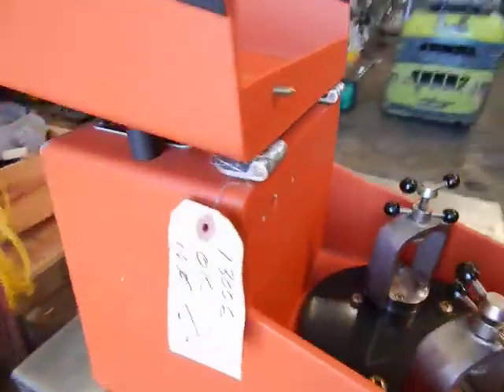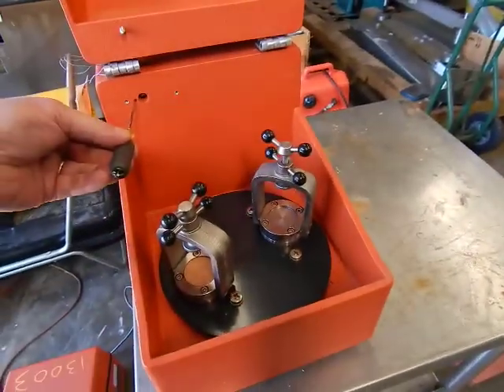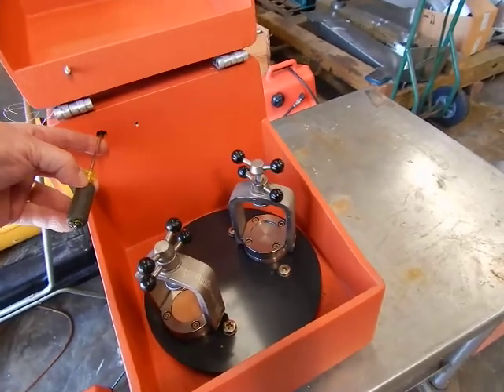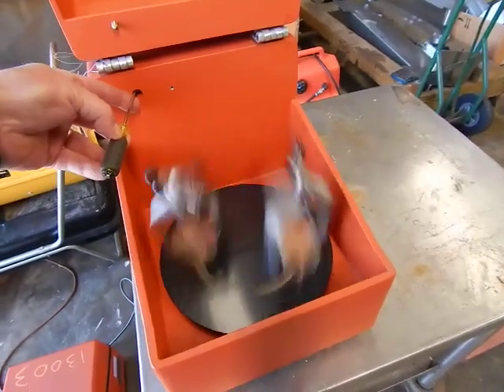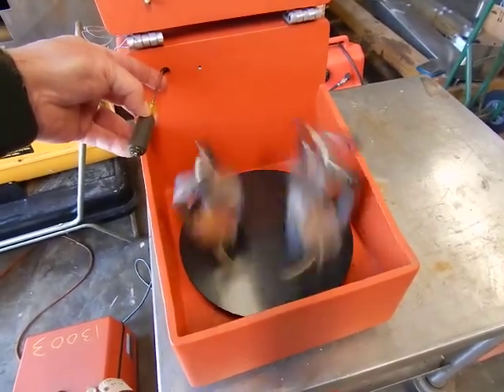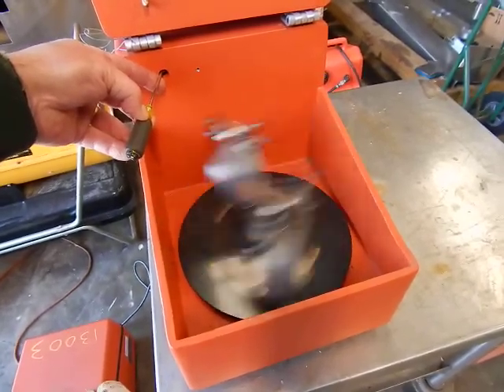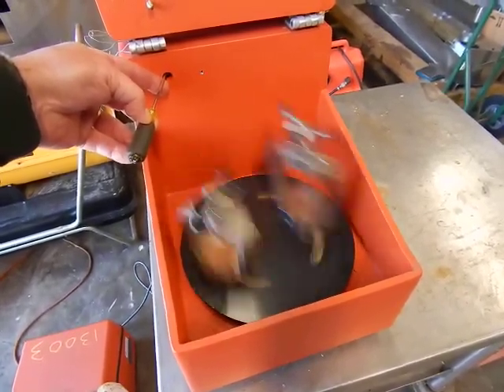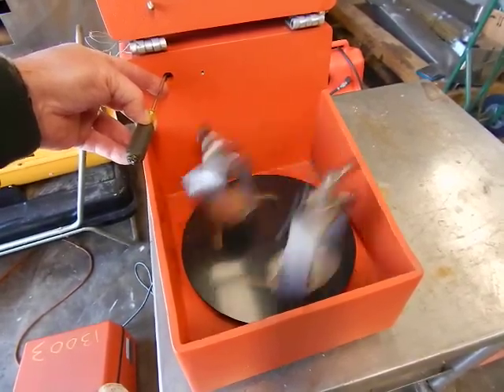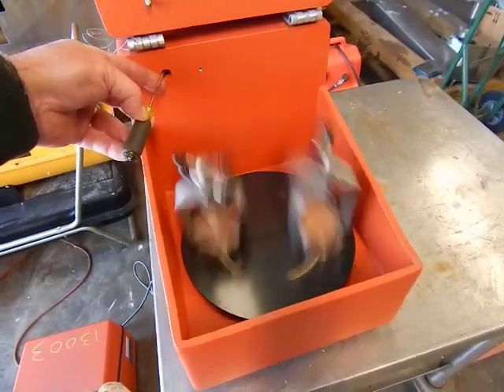When you open the cover, it immediately stops. We don't recommend you do that. There are two nice stops here — cushioned — for the cover. You want to be careful because the unit moves very quickly. I'm going to use a screwdriver to kick this on. It's running at about half speed right now — you can see it's quite quick. Keep your hands clear; it will catch you if you get in the way.